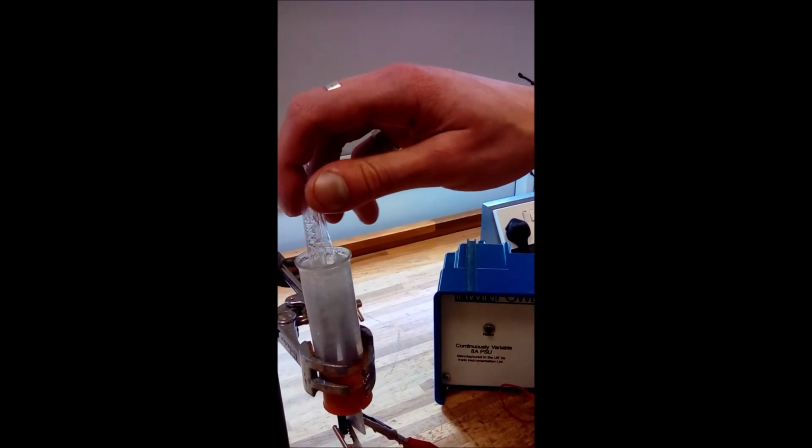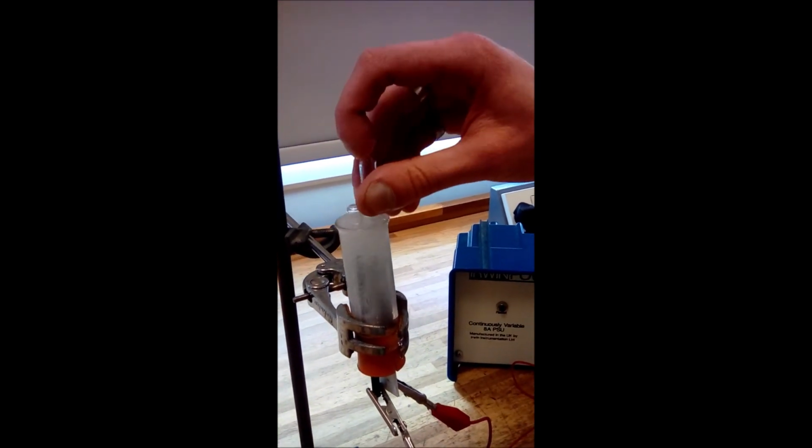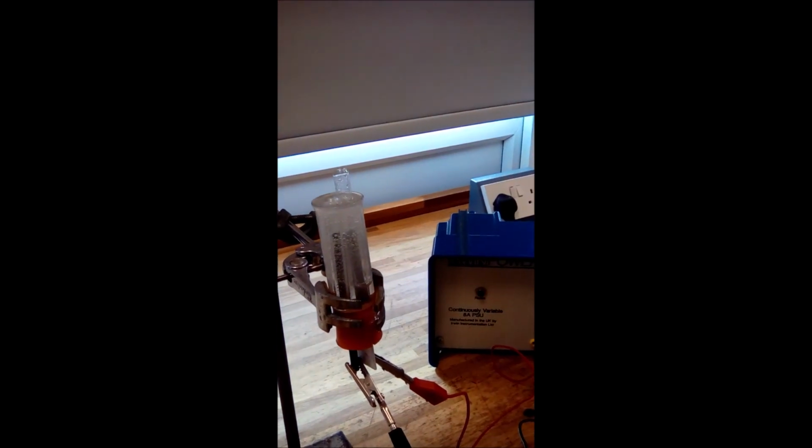And then this one is the negative cathode. Okay, so we weren't interested in this one, we were interested in collecting the gas at this one here. So I put that back on, and that will continue to collect chlorine gas in this anode here, sorry.